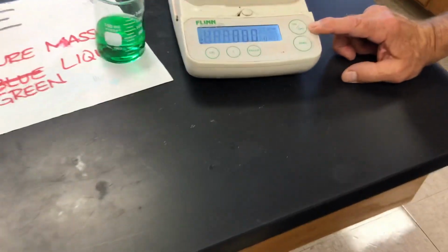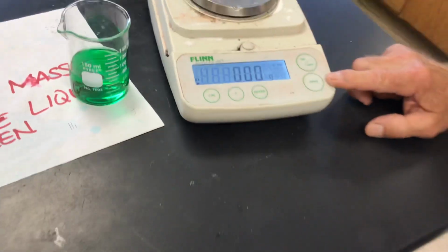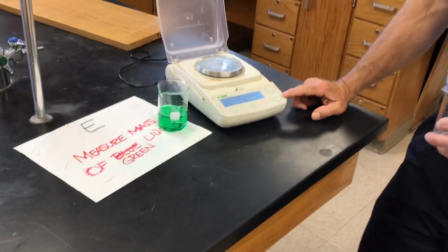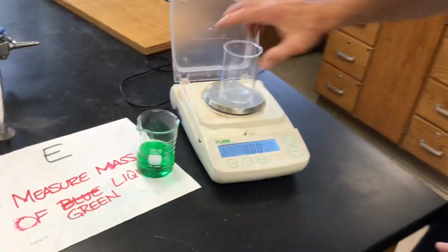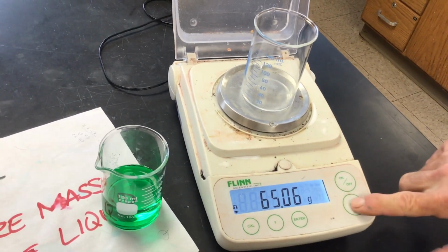Oh, but you know what, Mr. Moore? These balances have what's known as a tare function, where on the balance it says 0. The balance can be zeroed with an object sitting on there. So I could put the empty beaker on there, hit the 0 button, maybe.